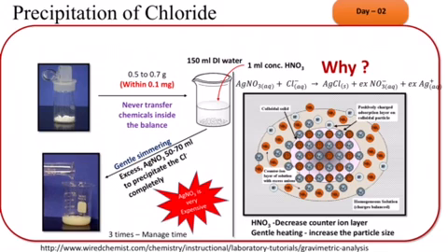If you have enough time, you can start doing the next step of your experiment. From your unknown chloride sample, weigh out accurately by difference 3 portions of the dried sample of about 0.5 to 0.7 gram, each to within 0.1 milligram.